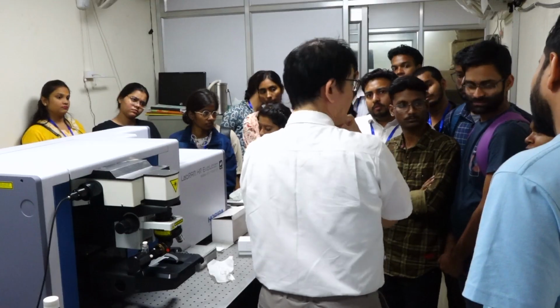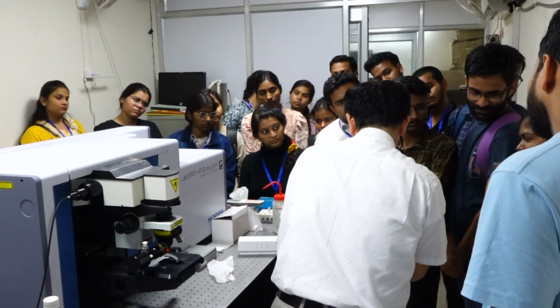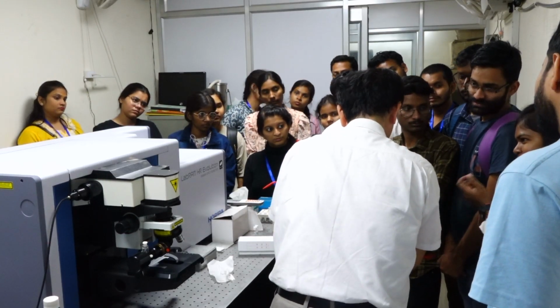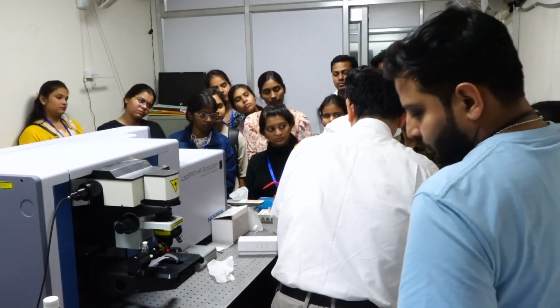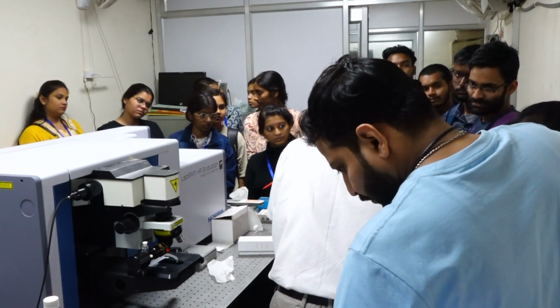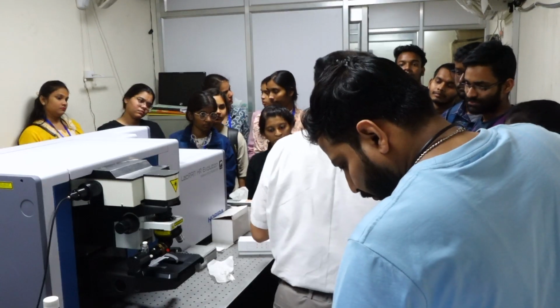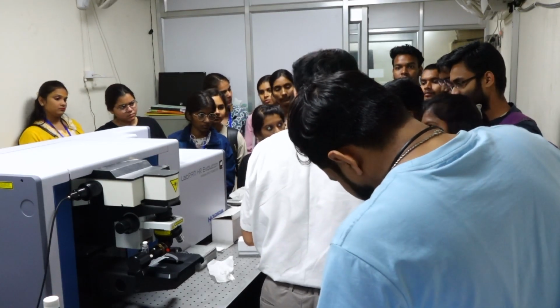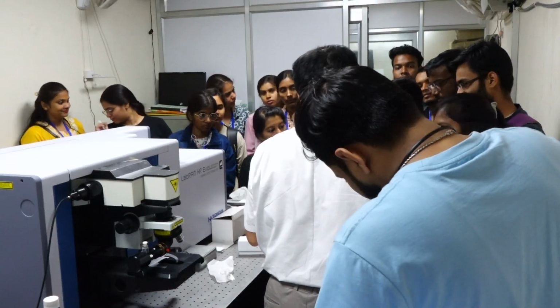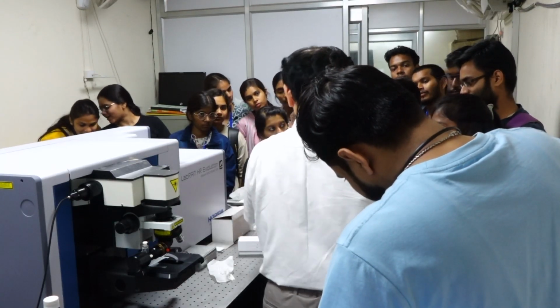I have a question. Can you explain more about backscattering? How is it happening? The scattered light is going in a particular direction. If light falls on a sample, light will scatter in all directions. So how is it going in a particular direction in the backscattering?